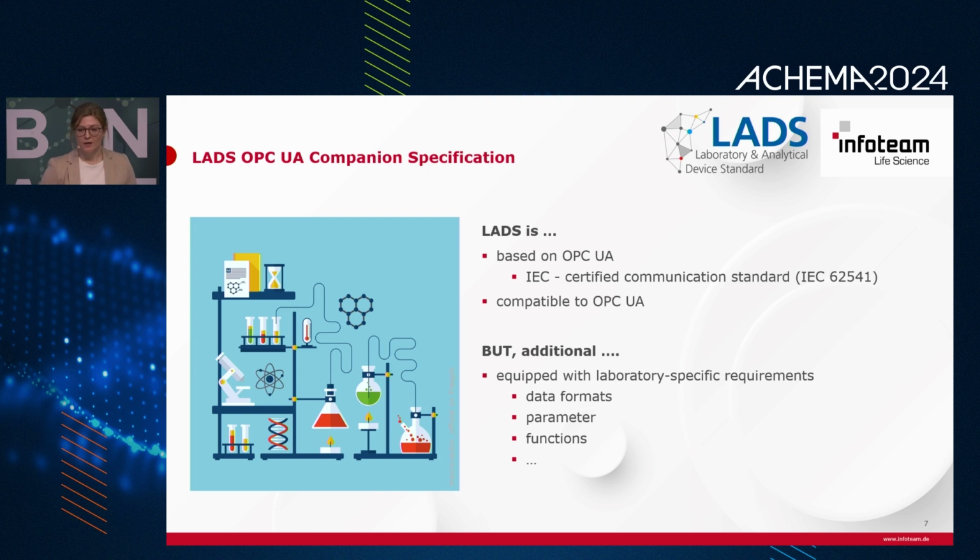Similar to OPC UA, LADS is also based on the IEC norm, so it's also compatible with OPC UA. But LADS is more specific to laboratory and analytical devices in regard to its data formats, functions, and parameters.